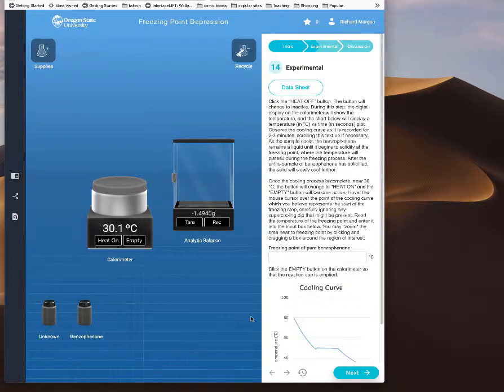So now, through the magic of movie making again, we're back down to normal temperature, and then we can just kind of get an idea. I'm zooming in here to get some idea of what temperature we're looking at.